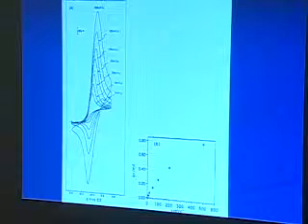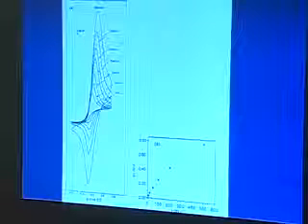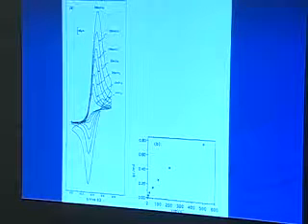And again, we started these scans over here. We go up this way, and there's our lambda point, and come back. And so this peak, we can read off that chart just from our initial current over here up to the peak. But for this peak, and that's actually what I'm plotting over here, we have to go out here. And we do have a very nice return side here. We're not messed up at all. And we have to make a correction for the baseline and come back. We did that using this chart technique here. But I also went back and did that data just by guessing, and I get the same result.